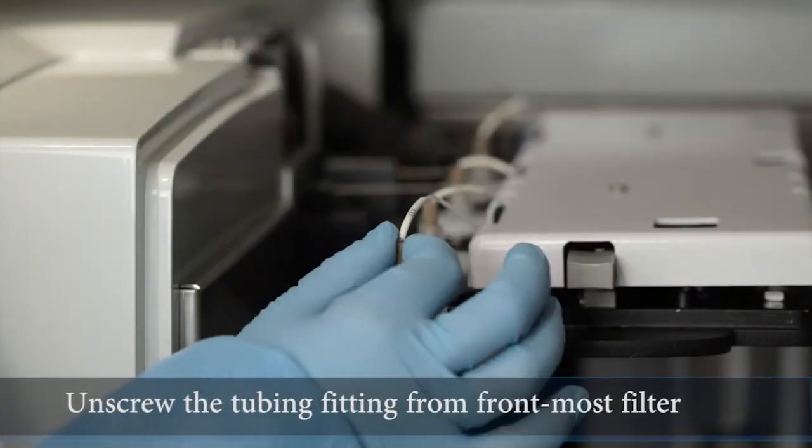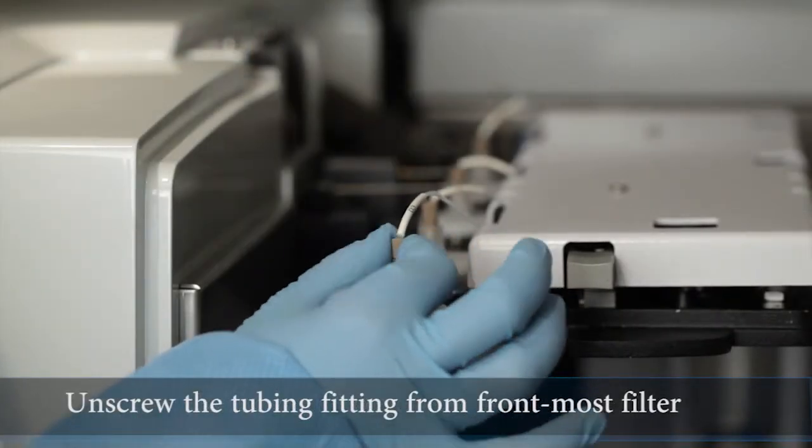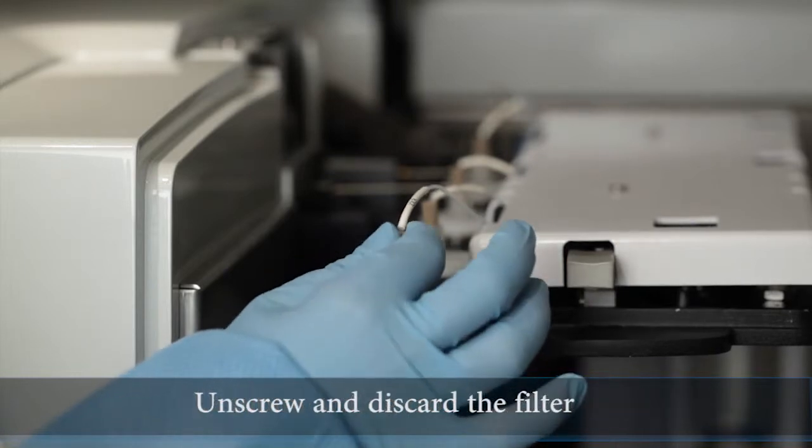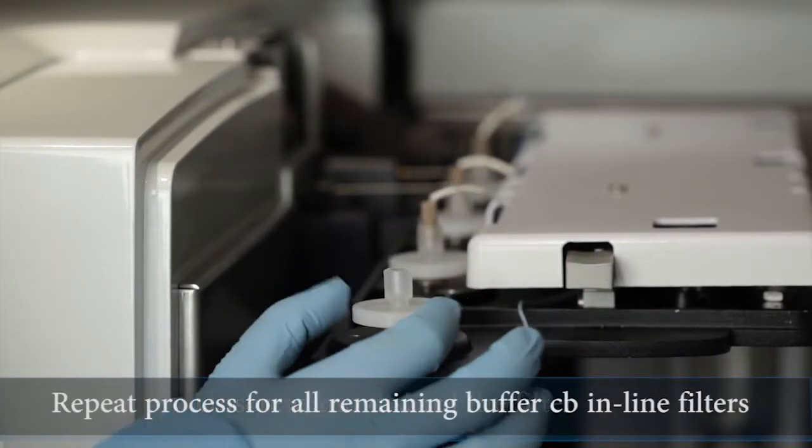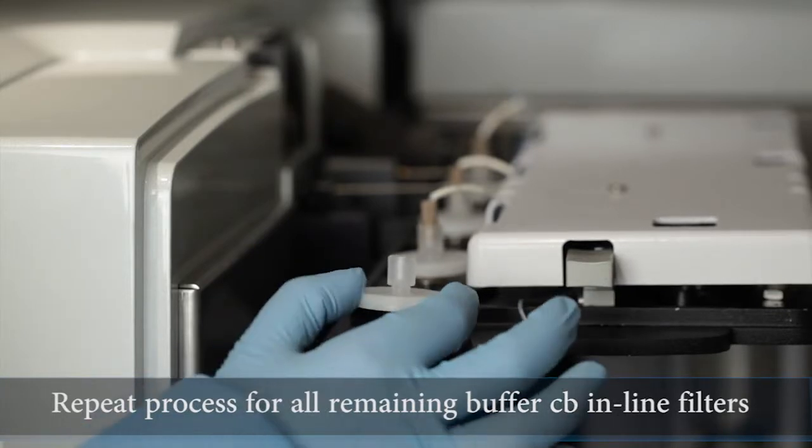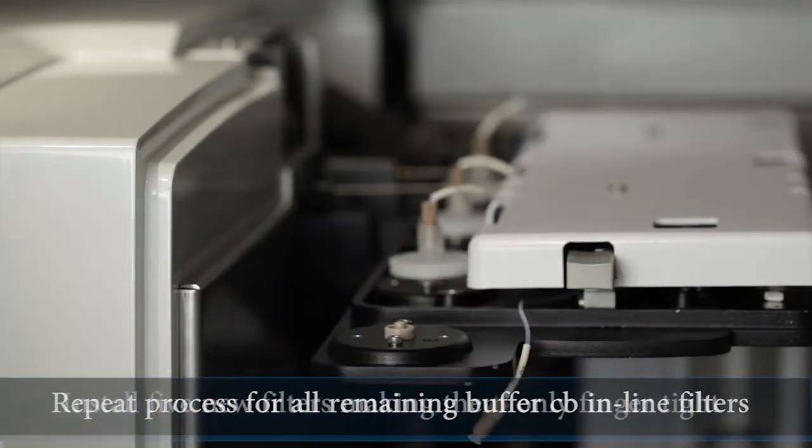Unscrew the tubing fitting from the filter located at the frontmost position. Unscrew and discard the filter, then repeat this process for all remaining buffer CB inline filters for a total of five positions.